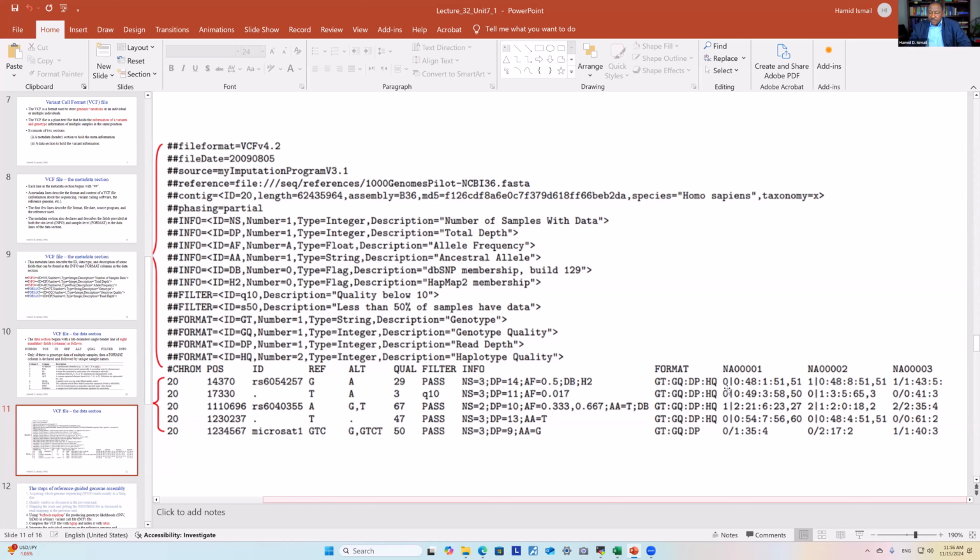The sequence of each allele, like each base, we also call an allele. So if you have a SNP here and here, we also call them alleles, because they do a specific thing here.